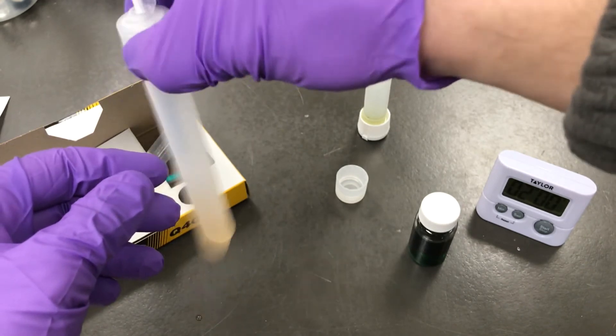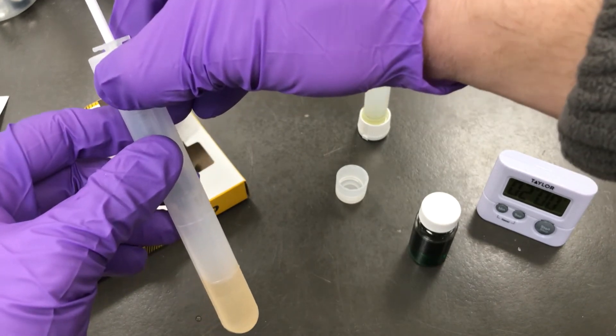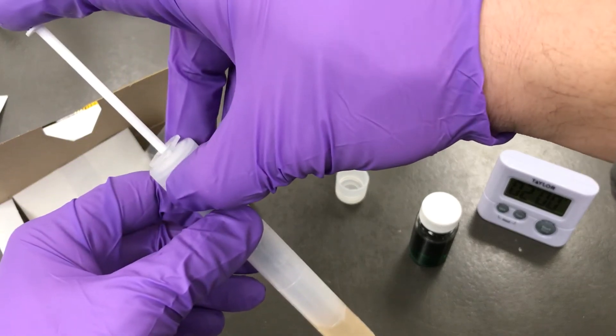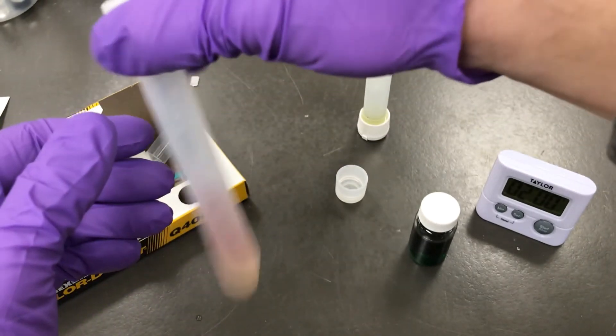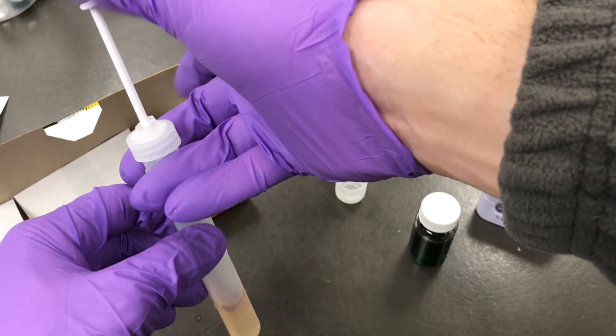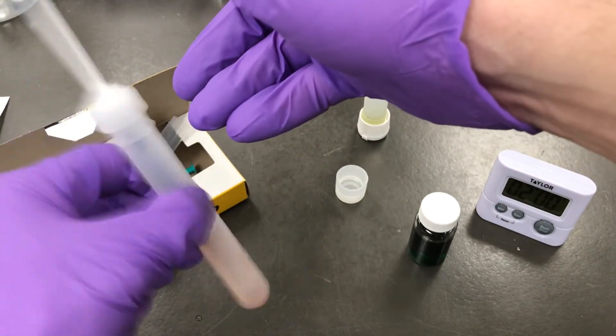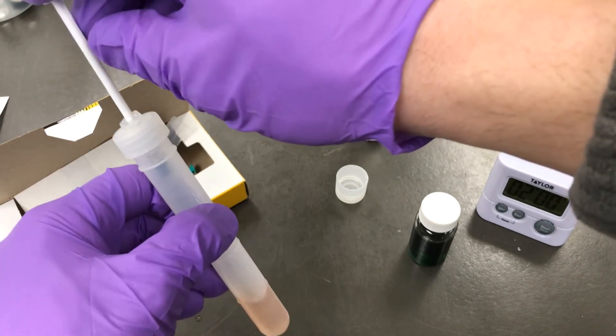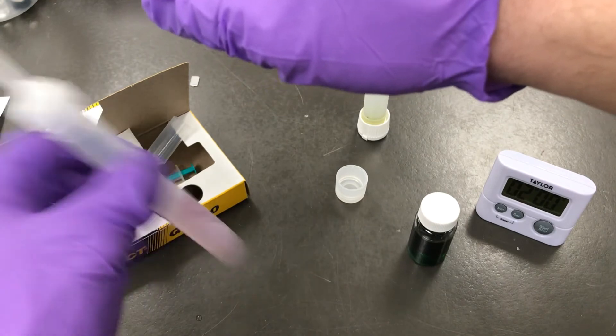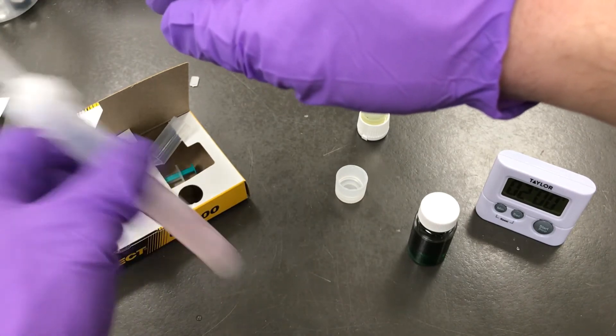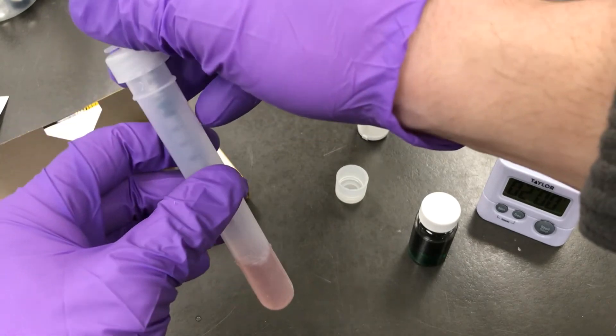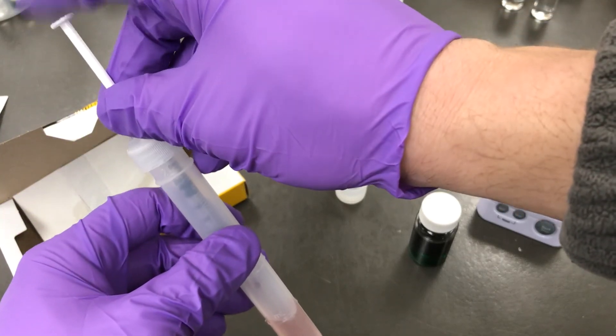Now, you'll want to start dispensing titrant dropwise and mixing between each drop. You'll notice that the color of the solution might change a little bit until you mix it and the color will fade away. You're looking for a color change from that yellow opaque color to purple, but you don't want to overshoot the endpoint. You might refer to the color chart in the instructions. You just want it to turn purple and stay purple after mixing.